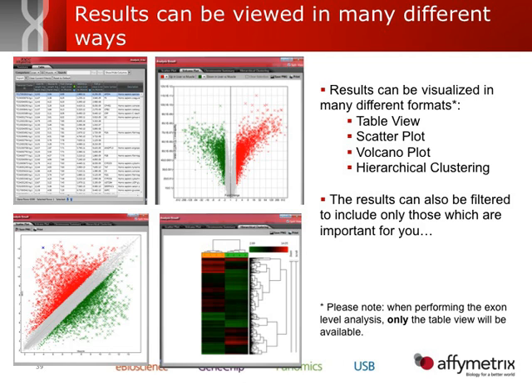And finally, at the gene level, we can do some hierarchical clustering as well. So if you wanted to generate a signature that helped you separate two subtypes of cancer or liver versus muscle or something like that, you can generate a gene list and then cluster those genes into the two categories, and that will help you discern a signature that can differentiate those two conditions from each other.